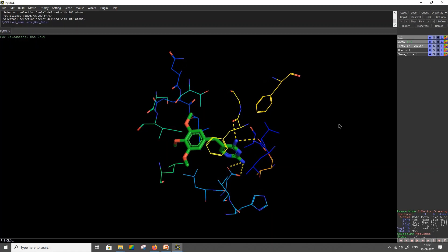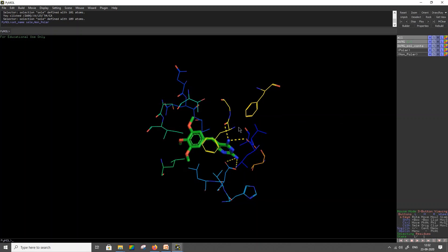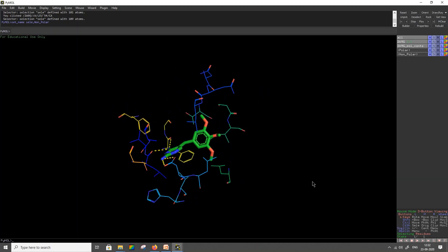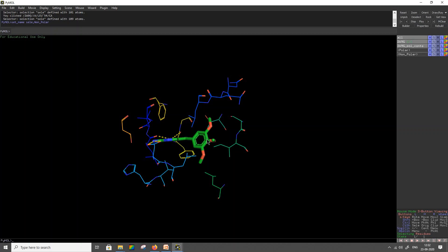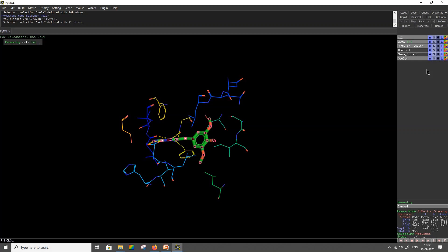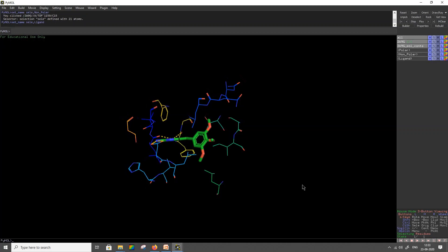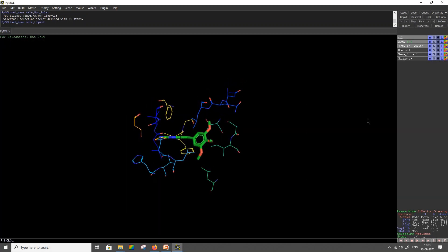Finally, we need to separate out the ligand for highlighting or differentiation. Click on the ligand molecule and rename this selection as ligand. Now it is easy for you to separate these out and label them individually.